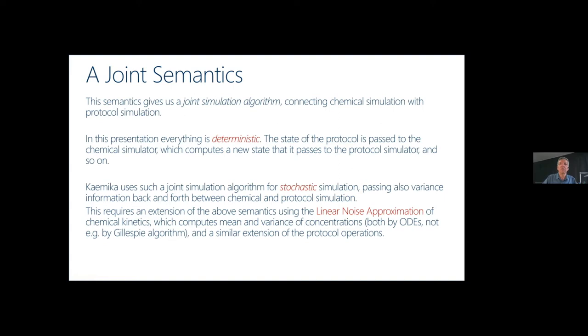So Kaemika uses the linear noise approximation, LNA, which is an ODE-based technique. It's not a Gillespie. It's an ODE-based technique which can be applied to any chemical system, no restrictions, and that's why it's so nice, and it can compute the mean and variance of concentrations of all the chemical species. And also we can extend the classical LNA for chemical systems to liquid handling steps and cause propagation of means and variances across mixing and splitting of samples.